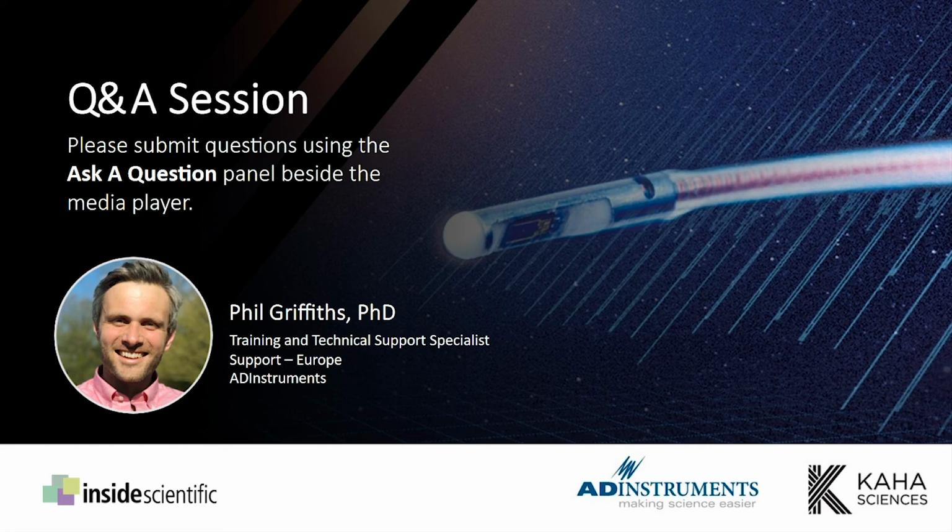Okay, great. Another great question here. This question is, when reusing the EEG/biopotential units between different animals, can you address how or whether one can lengthen the lead wires if needed?